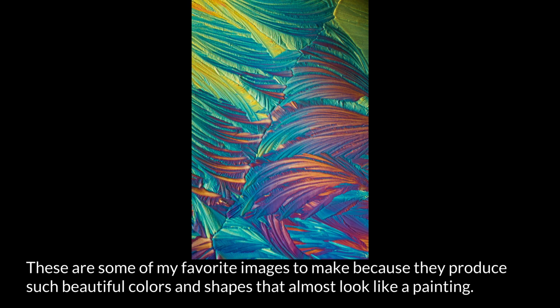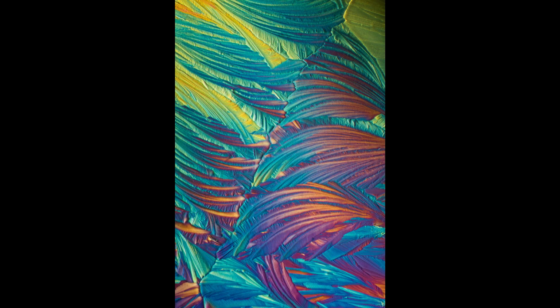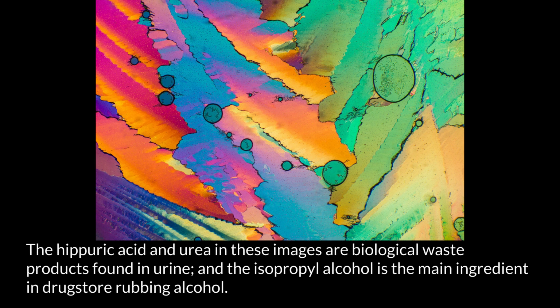These are some of my favorite images to make because they produce such beautiful colors and shapes that almost look like a painting. The hippuric acid and urea in these images are biological waste products found in urine, and the isopropyl alcohol is the main ingredient in drugstore rubbing alcohol.